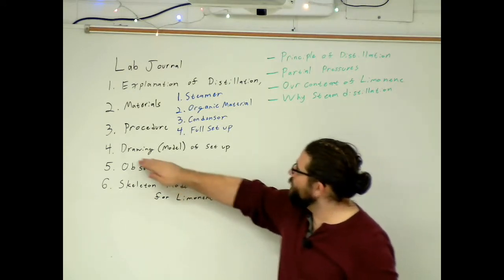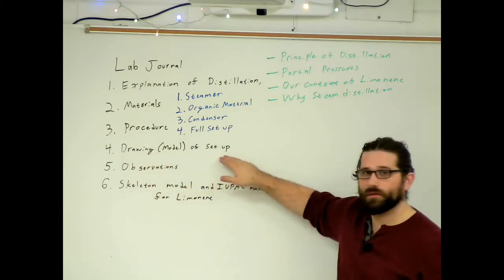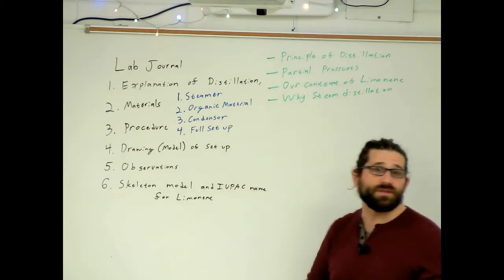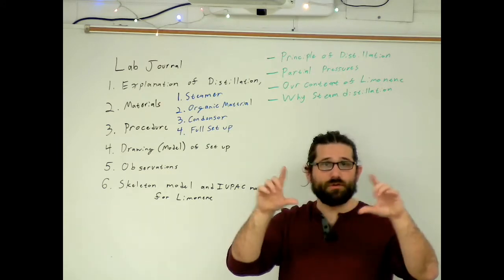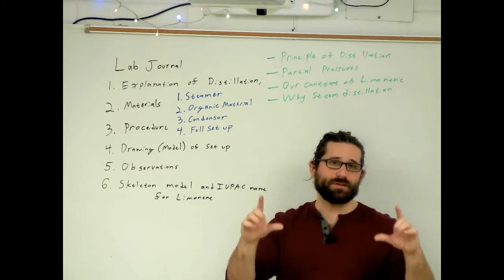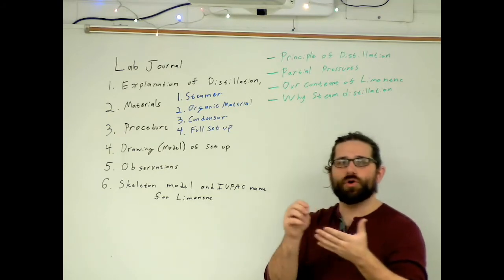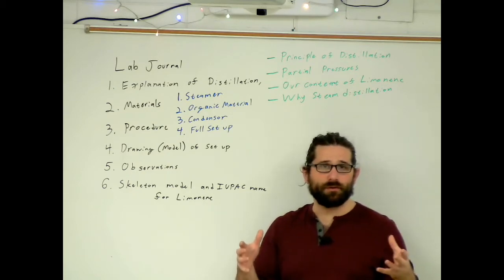Next, you'll have a drawing model of your setup. Now, the document that I'm giving you, that is going over the different types of distillation, has a computer-generated drawing of a steam distillation. You'll mostly copy that, but I need you to draw your own so I can see that you've got an idea of how this fits together.